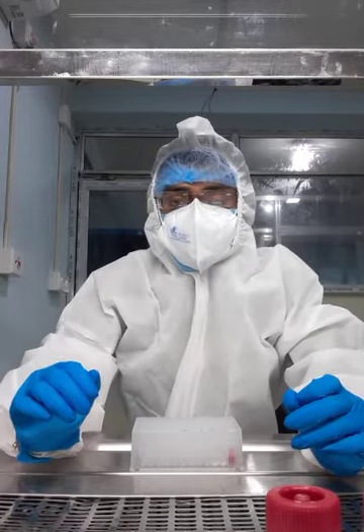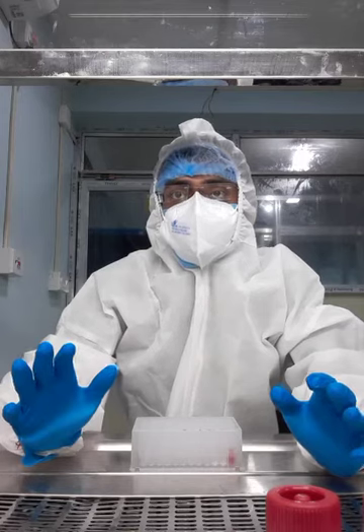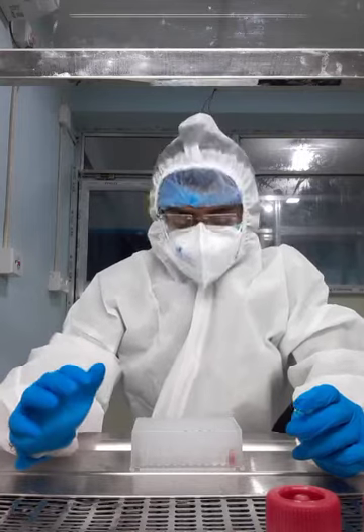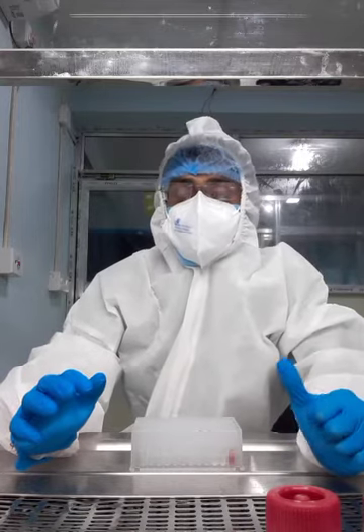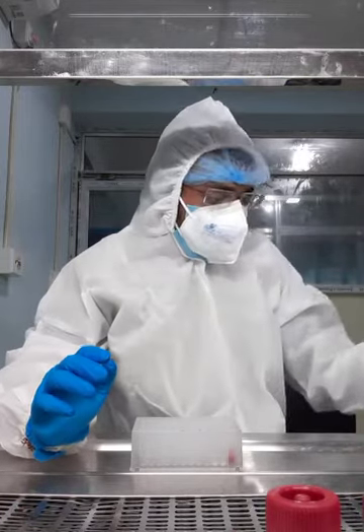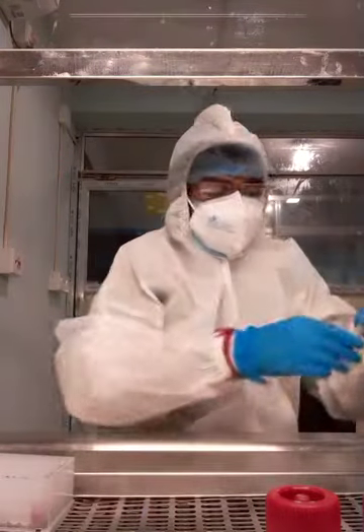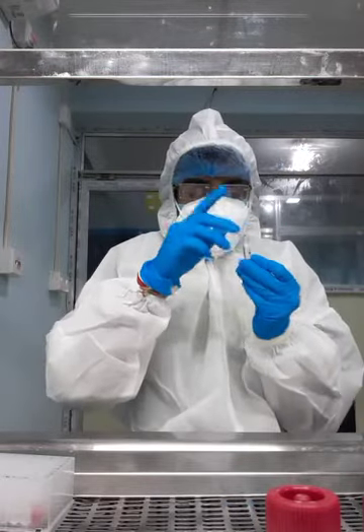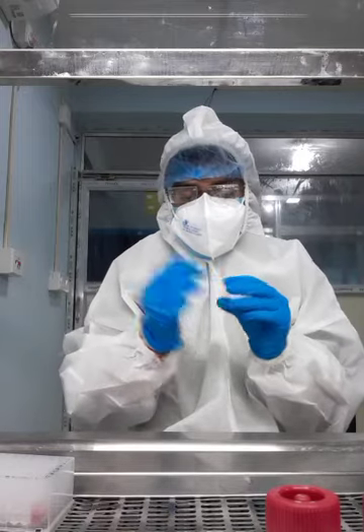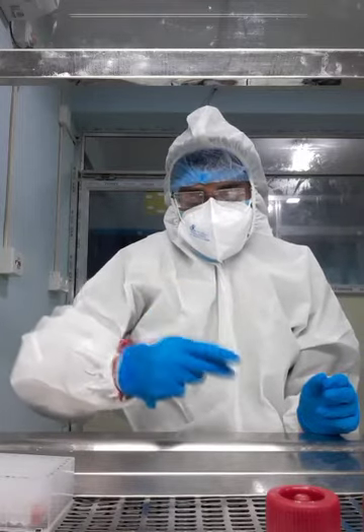Before putting the 100% ethanol, you have to keep the VTM sample and T-lysis buffer after mixing for 5 minutes at room temperature, 3 to 5 minutes. Now I already put the 350 microliter 100% ethanol. Now it's time to put the magnetic bead. Before putting, you have to shake it with your hand for 5 to 10 times.